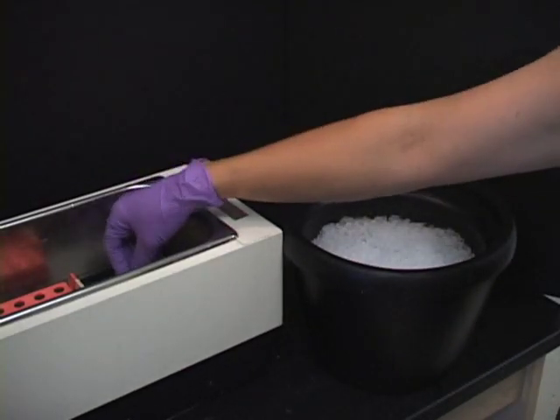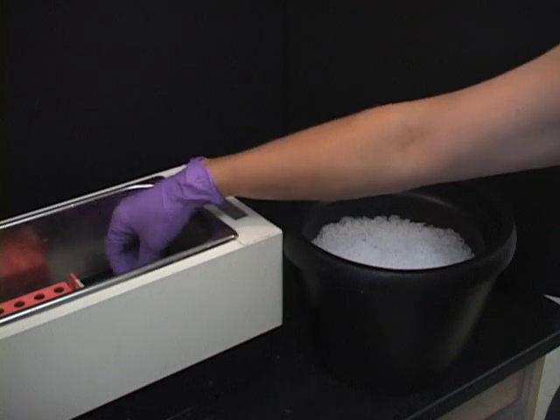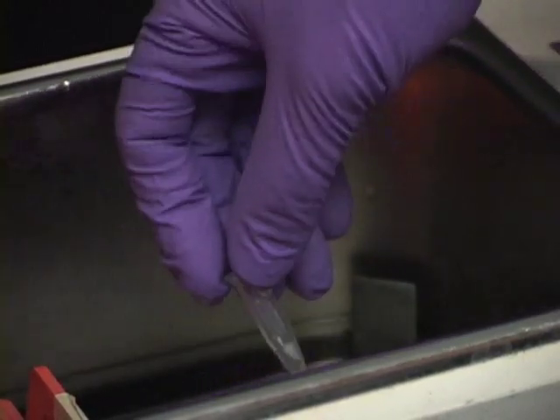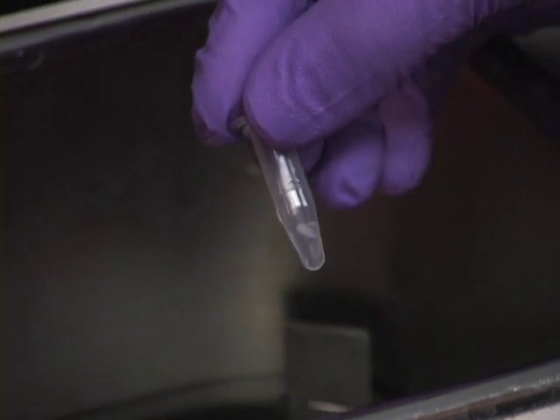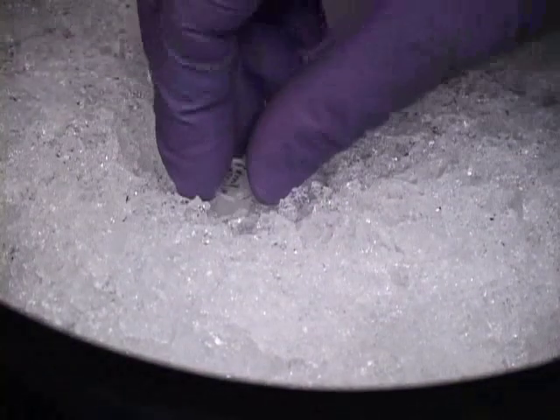Flash thaw your binding protein at 37 degrees, leaving a small amount of ice in the tube. Quickly place on ice.